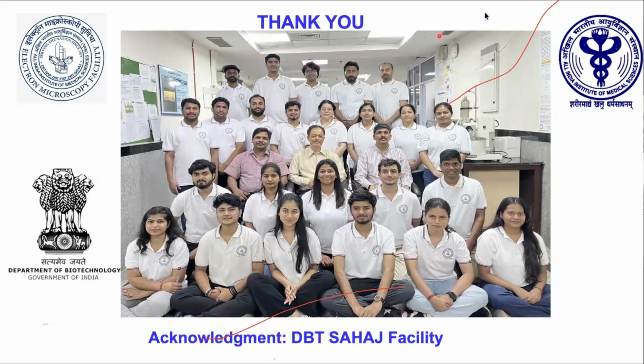So both ways are possible: you can come, or you can have remote access. Once the data is ready, we can give you remote access to download it. We are developing the whole server system; now every server is connected with each machine, data is poured there, and we can give you access. For two or three days, you can download your data.